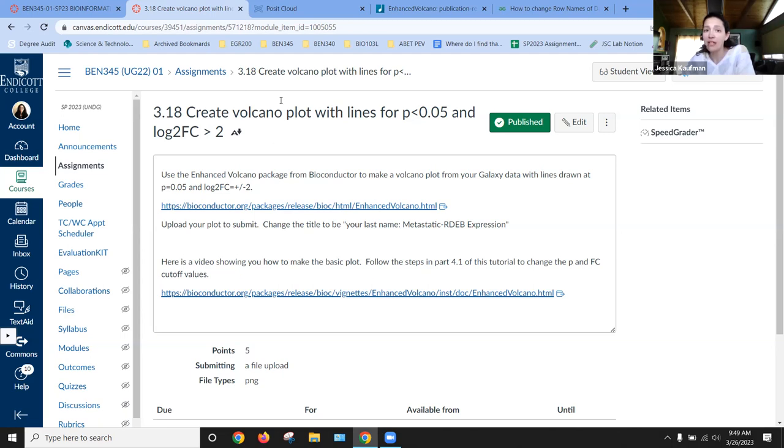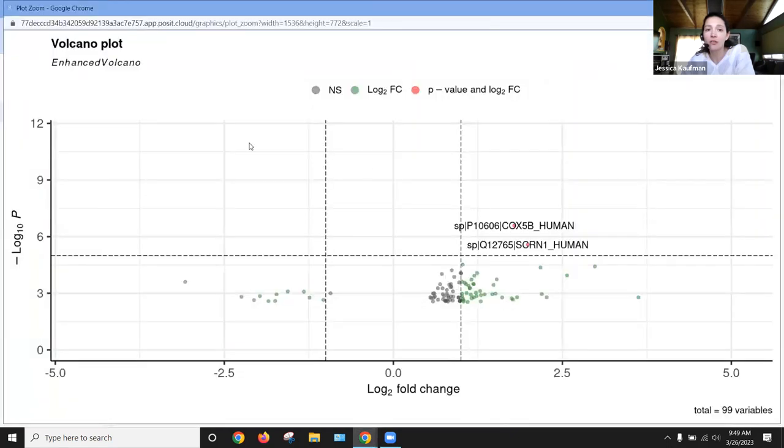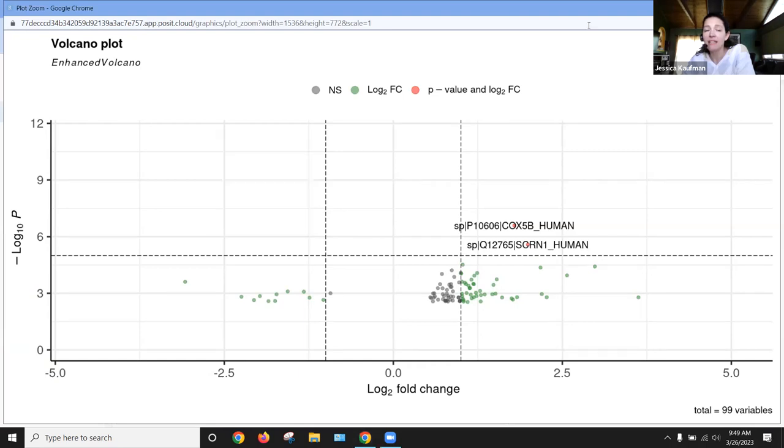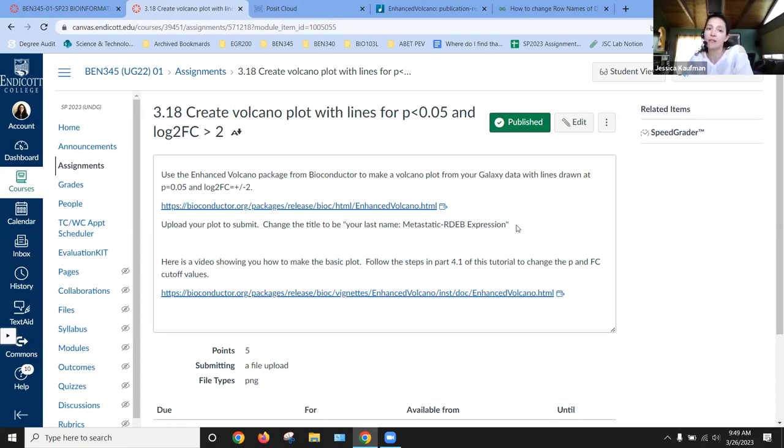Once you've made that change, you will go back to your plot, zoom in on it, right click or two finger click, save image as, and in the assignment, it tells you to save it as your last name colon Metastatic-RDEB Expression.png.